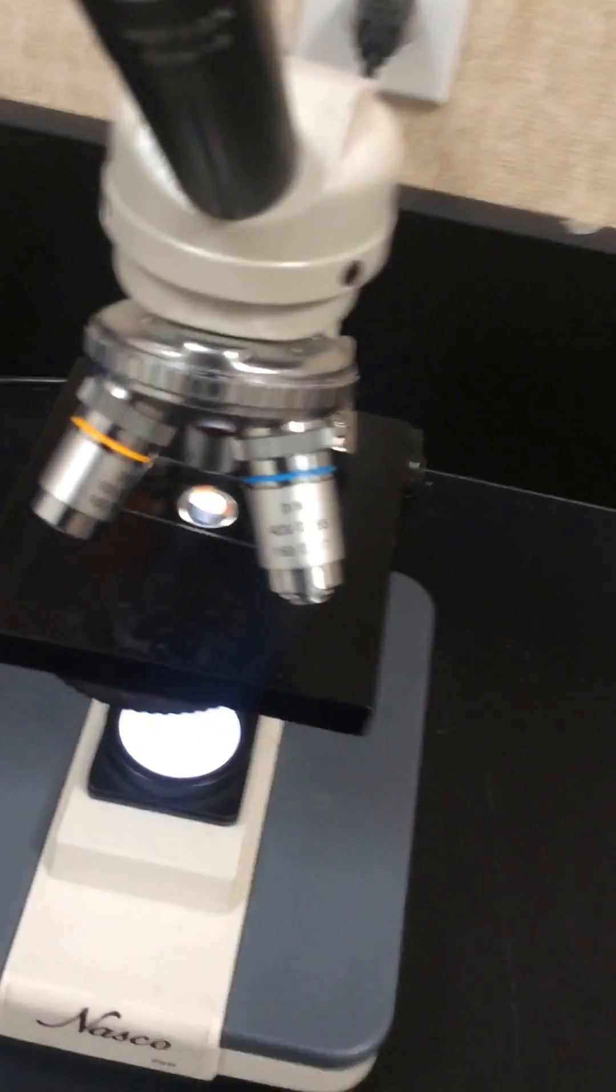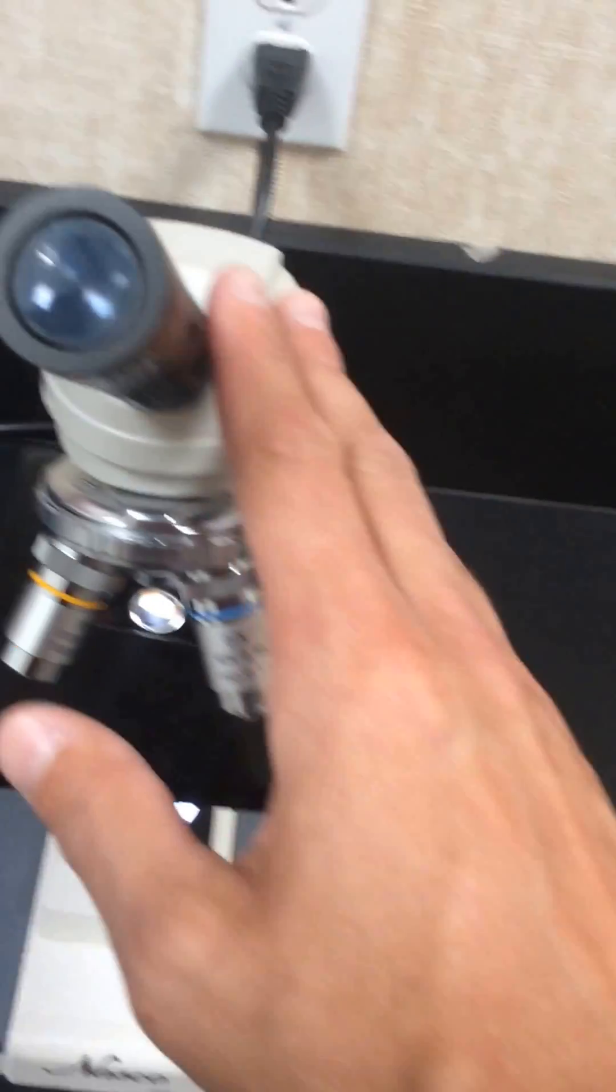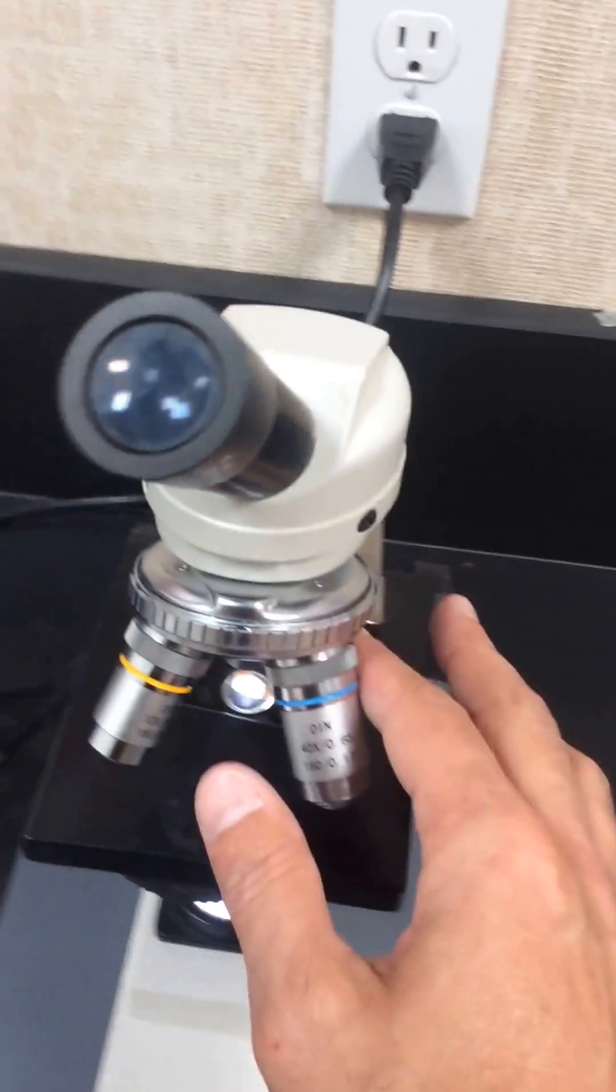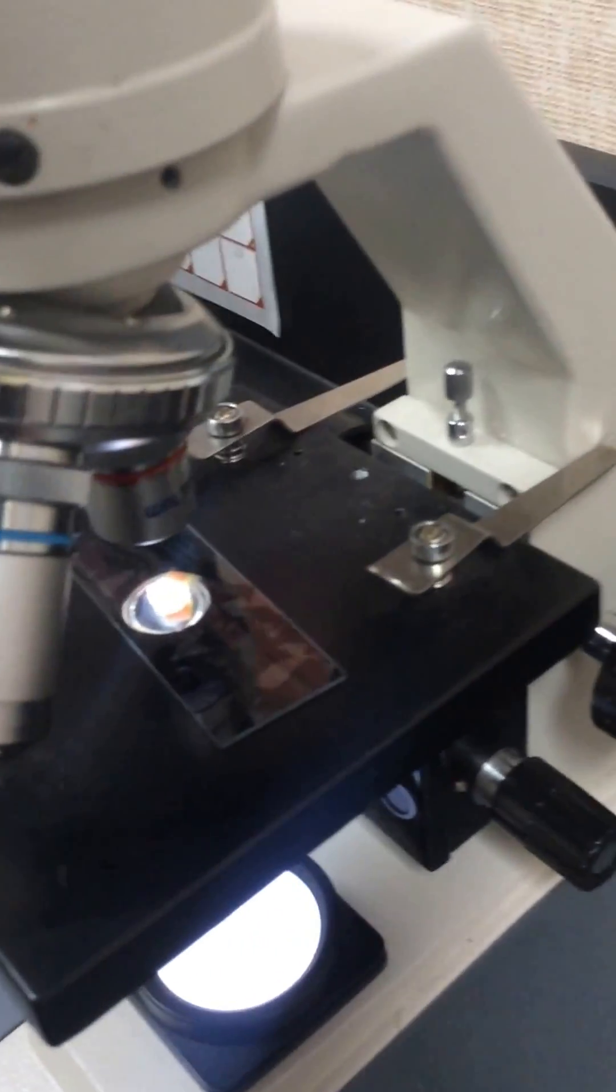As you can see here, I've got my specimen there. In this case, it's an Apple Peel, and I've already focused it in. I'm using my low-power objective lens.